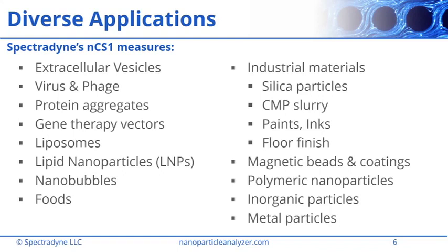One case I'm thinking of, I don't have the slides here, but they're available in our library on our website, shows that we can see a viral peak in the size distribution emerge as the purification progresses through different stages. So the NCS1 becomes a tool for quantifying the purity of their viral preps as well. Hope that answers your question.